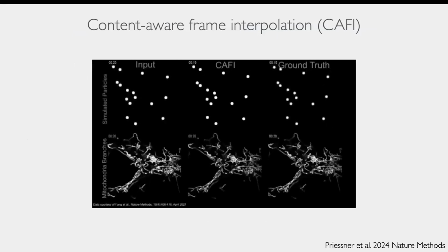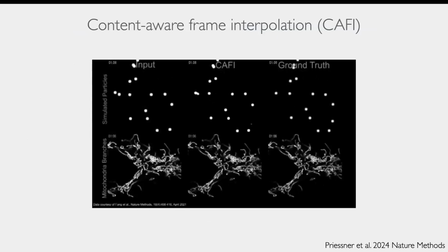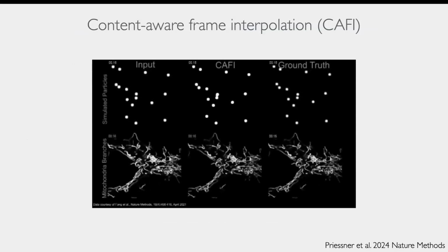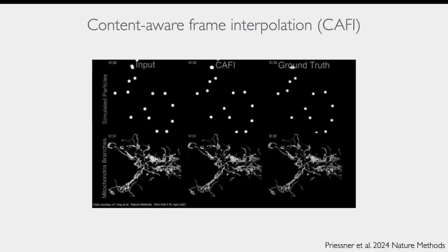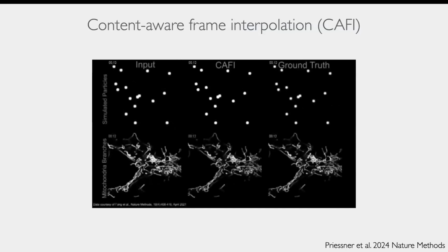And the same applies to other dimensions as well. There's a very interesting paper that came out recently looking at how to deal with the problem of when you're imaging over time, especially if you're doing 4-dimensional imaging, you have gaps between the volumes and objects can move quite a reasonable distance. And so how can you actually fill in those frames so you can track those objects better?